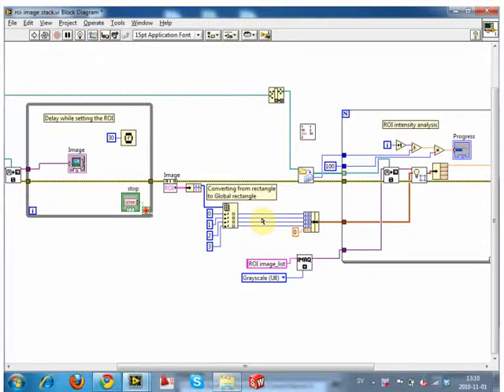Okay, so this is session 3, and just to clarify why we have this up on the screen, I'm showing what we're doing today. So today we're going to build this sub VI, and we're going to explain what it's for. And essentially it's a direct replacement for this one that we've used in the first couple of sessions.